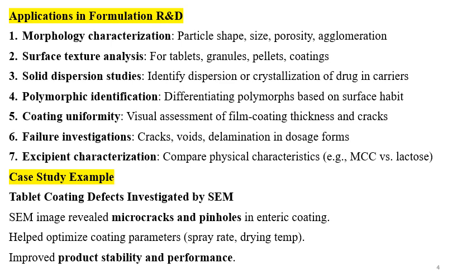Solid dispersion studies identify dispersion or crystallization of drug in the carriers. If you are converting the crystalline material into amorphous, and you want to identify the dispersion or crystallization, you can use this technique. Polymorphic identification, so differentiating the polymorphs based on the surface habit can be done.